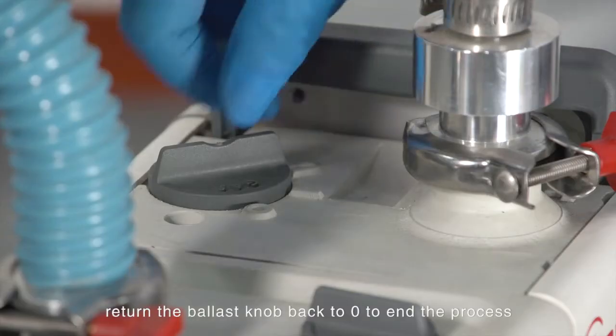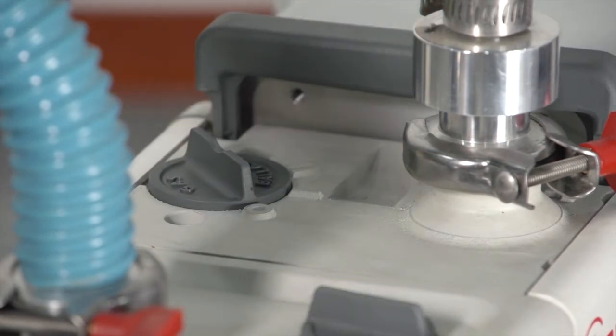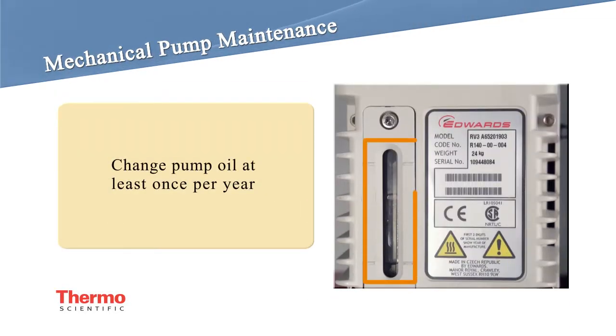After about 10 to 15 minutes, return the ballast knob back to 0 to end the process. The pump oil color can be observed through the glass window on the pump.